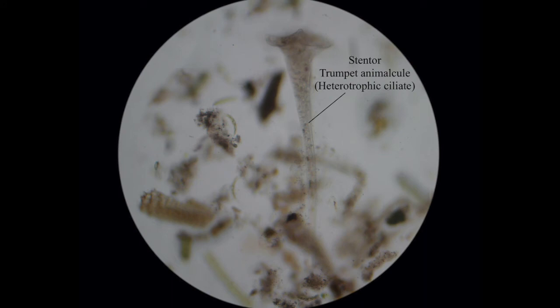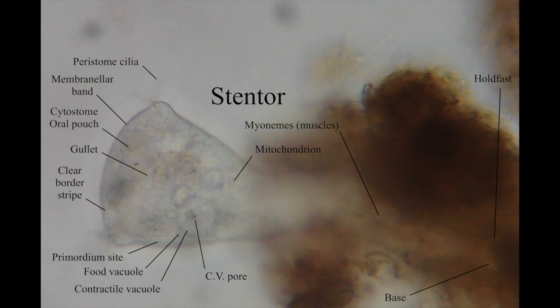This is similar to vorticella but it's stentor — you can't really confuse them because it's much, much larger. It's tube-like with a sort of mouth at the top and it siphons in microorganisms and ingests them. Here's a close-up of stentor and I've labeled all the main features.